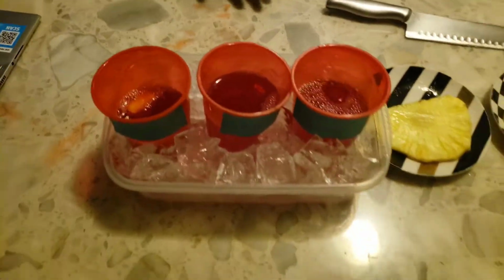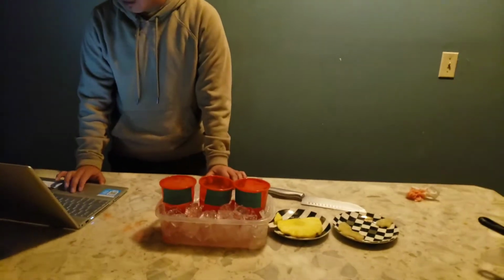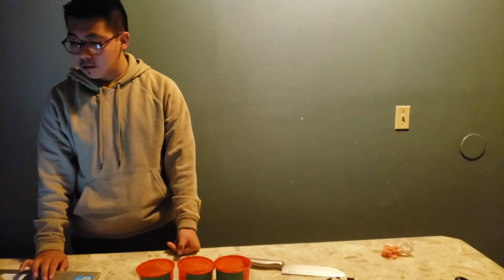I will be observing the reaction every 2 minutes for a 10-minute span. Starting now.